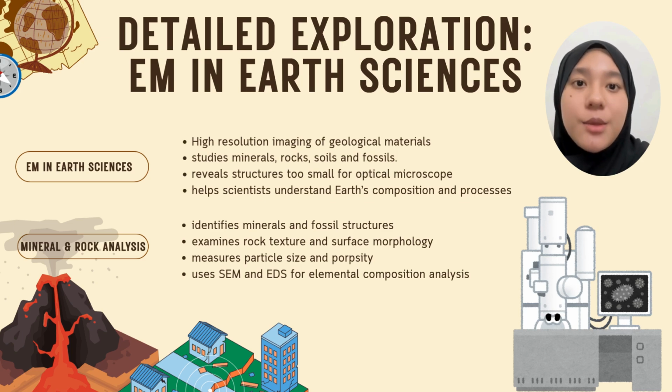Using a scanning electron microscope, which is SEM, researchers can examine the surface features of minerals, determine the grain size, and identify mineral species that are too small to be observed using a conventional microscope. This information is essential for understanding the formation and evolution of rocks.